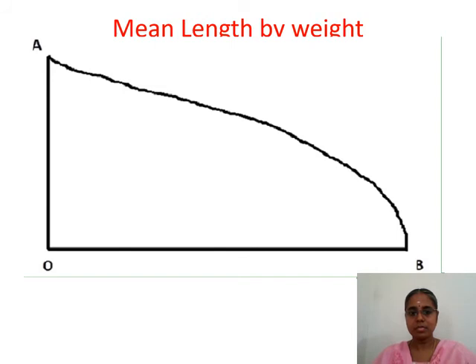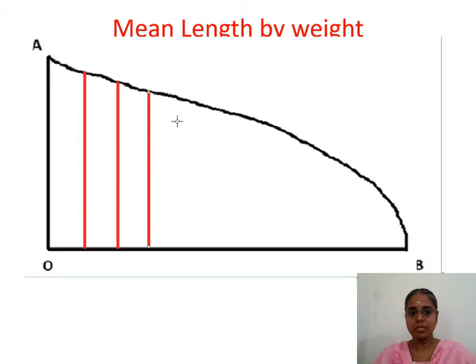Now you are dividing the total sorter diagram into various length groups. You are dividing into a first length group, the length above this, and various length groups, almost equal length groups. So like this, you are dividing, continuously till the end. I am not drawing it in total.